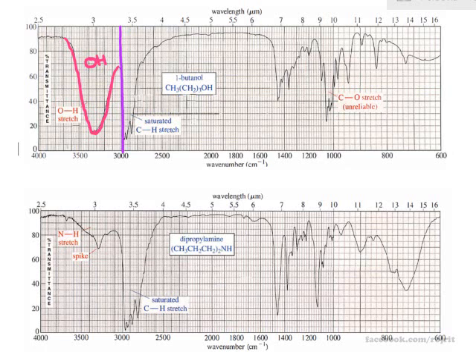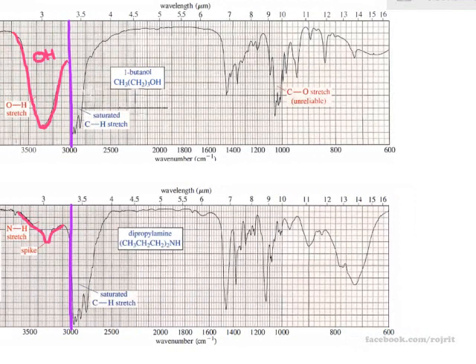So as you can see, this absorption is not as strong as the OH. It's dropped by this. And this is 3000. You have to mark 3000 first. Okay, so another characteristic of NH here, I would mark it around here.